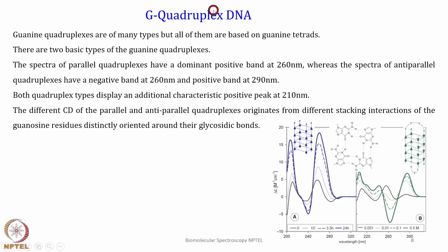So, this is an example of G-quadruplex DNA, right. In the quadruplex, you see these are parallel 1, 2, 3, 4, four strands in the same direction, and basically the hydrogen bonding is like here. You can see 2 hydrogen bonds here, 2 here, and 2 here, 2 here. So, that is the hydrogen bonding that is happening, and this is an anti-parallel T quadruplex, a tetrad or quadruplex we call it.